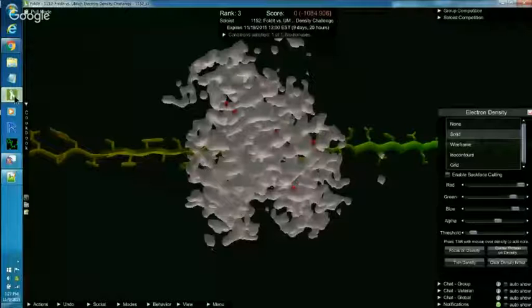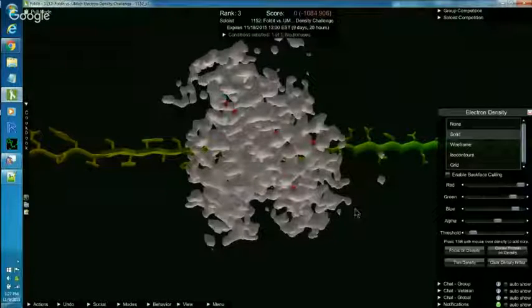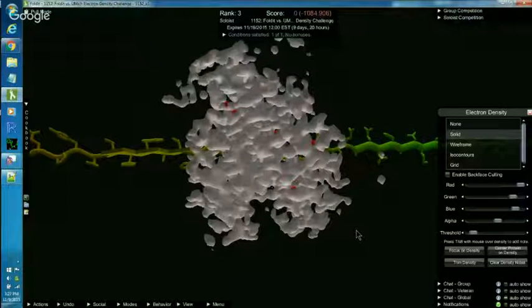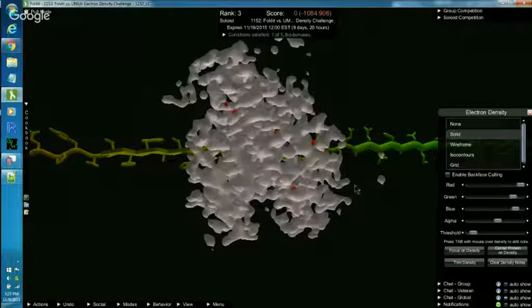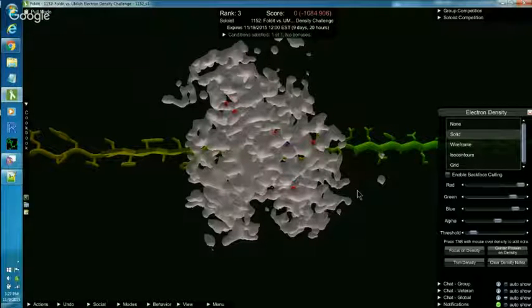Hi everyone, Susumi here. I'm talking about how to find shapes in the Foldit Electron Density Cloud and we are looking at puzzle number 1152.